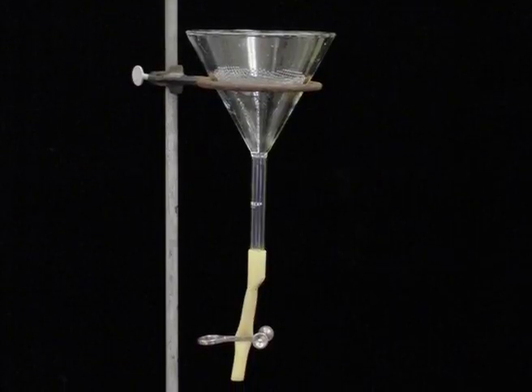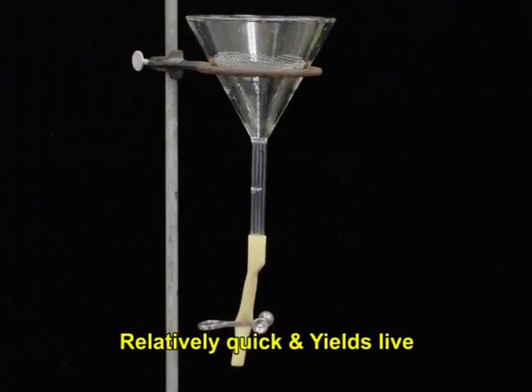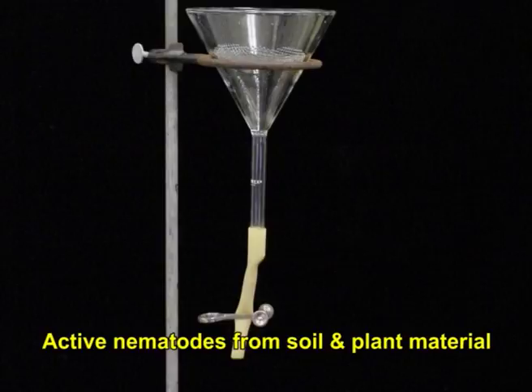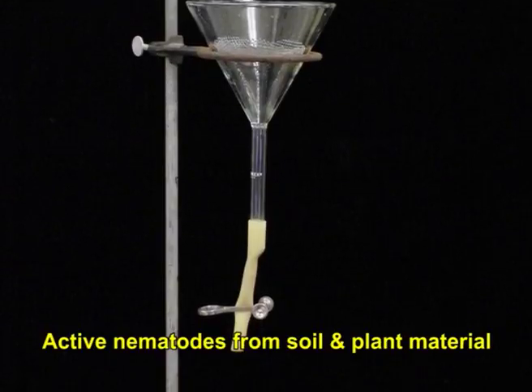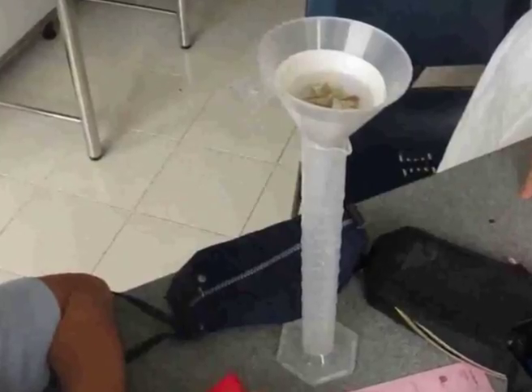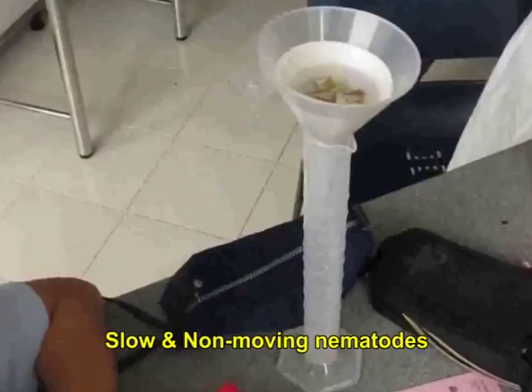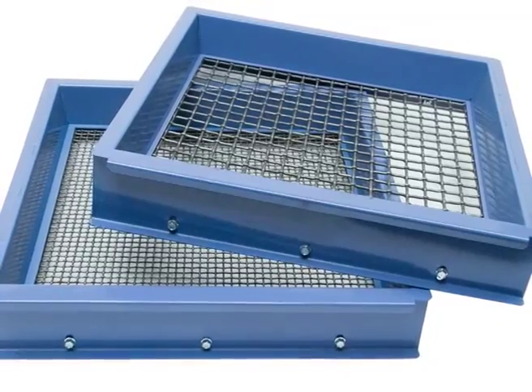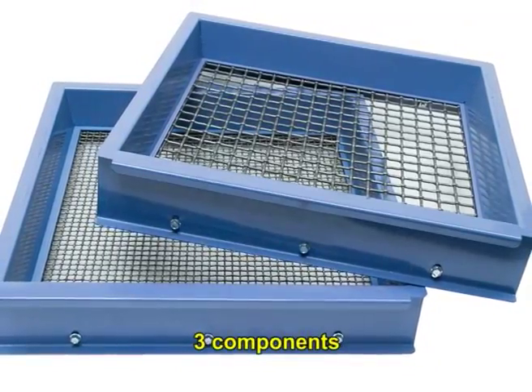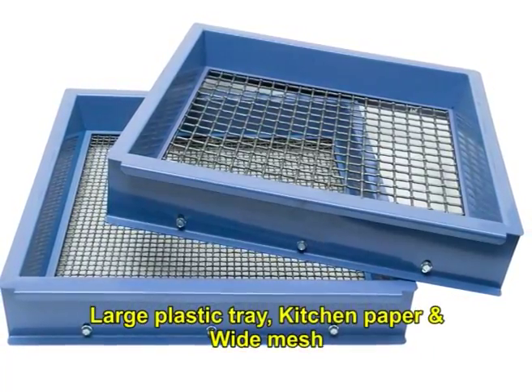This method is extremely cost effective, relatively quick, and yields live and active nematodes from soil and plant materials. But this technique is not quantitatively reliable, as it selects against slow and non-moving nematodes. This technique makes use of three components: a large plastic tray, kitchen paper, and a wide mesh.